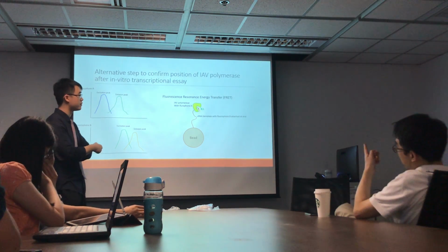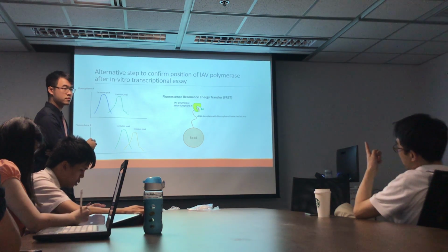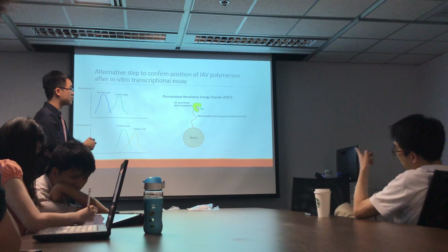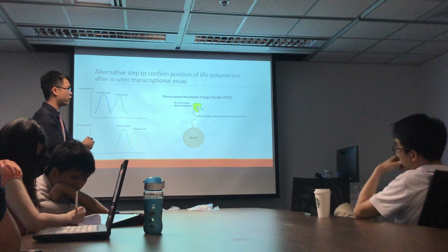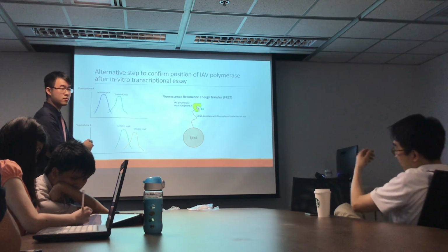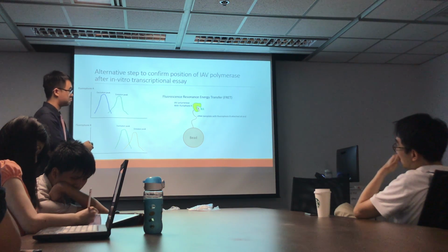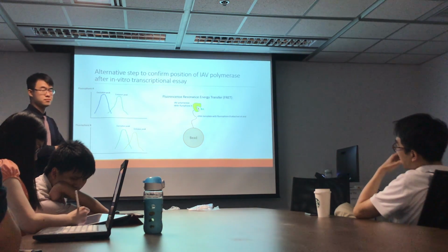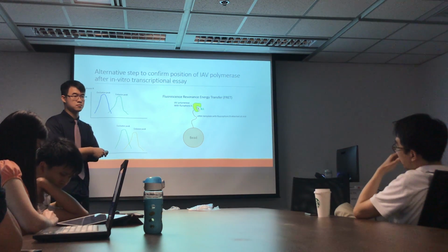So you're talking about B1, B2, B3, they're all different. Now you only attach a B to the RNA. Now you're talking about attaching different B1, B2, B3 at different positions of the RNA to monitor the reaction. I mean different fluorophores, so fluorophore B, C, and D, for example. Yeah, then you may need tons of fluorophores to do that. The template is quite short actually. It's 14 or 15 something.